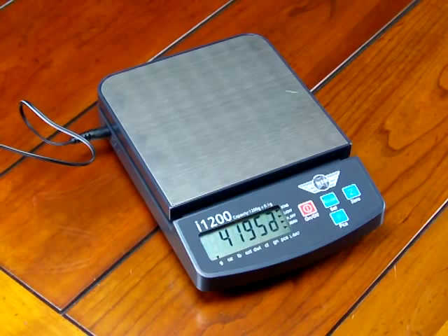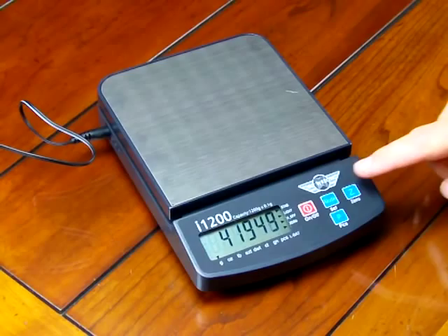This number really means nothing to the end user — it's just the value of the signal coming off the load cell going into the A to D converter. We need to store this value; we call this the zero reference. Nothing is on the platform, and we are storing this value so that the balance knows this is 0.0.